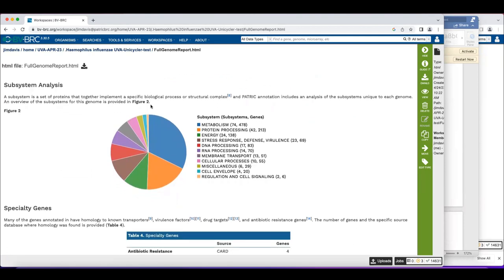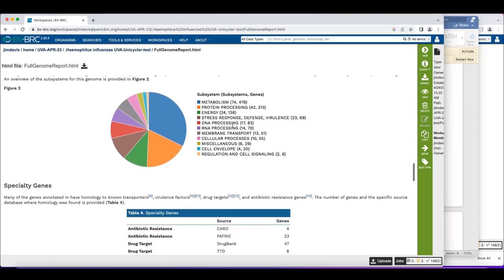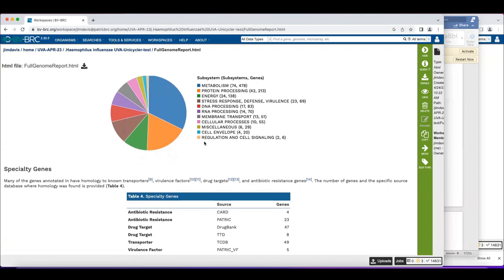The subsystem pie chart is very useful. Subsystems are functions organized by cellular machinery — for example, a transcription subsystem might contain RNA polymerase and sigma factors, or a translation subsystem contains ribosomal proteins. This pie chart gives a very high-level view of what your genome encodes. Genes with complete EC numbers and genes annotated within subsystems are generally the highest-confidence calls, as they've been annotated by curators and projected onto your genome.